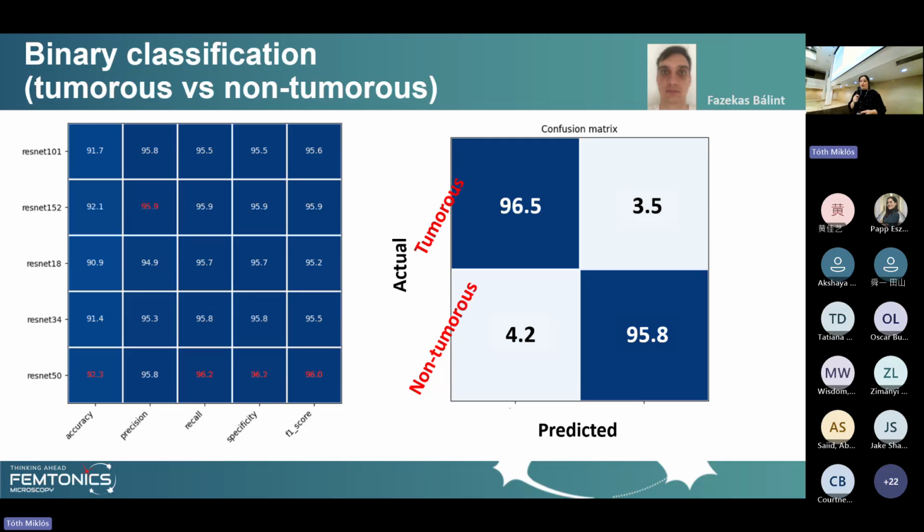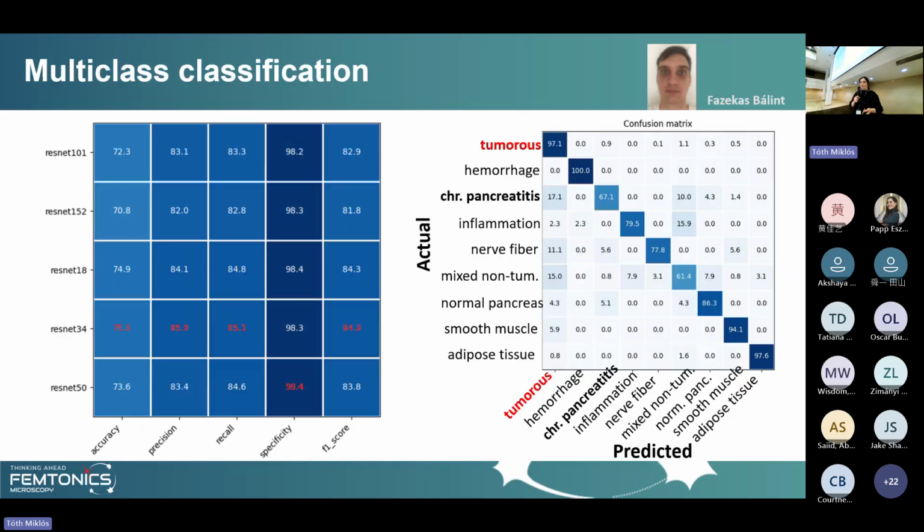And our results show that the SRS image data contain enough information to learn tumor-related patterns. And this supports our central message here that even when direct stimulated Raman histology-like images cannot be made, AI can still extract relevant information for diagnostics.